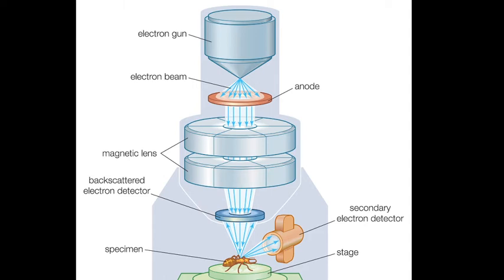After all these things, the electrons can reach the surface of the sample, or hit the surface of the sample. So three things mainly happen here. Sometimes the electrons get absorbed by the sample, sometimes they may be reflected by the sample, and sometimes the electron can excite the surface molecule. That molecule itself releases an electron, and that electron is known as a secondary electron.